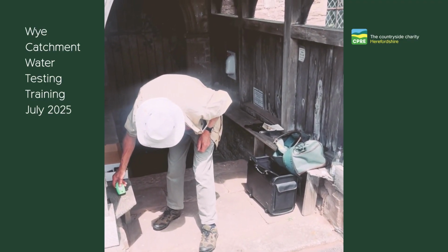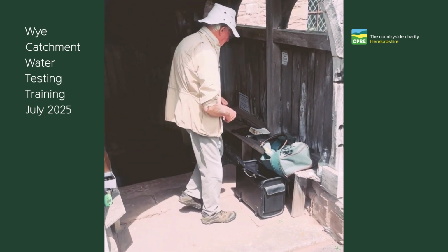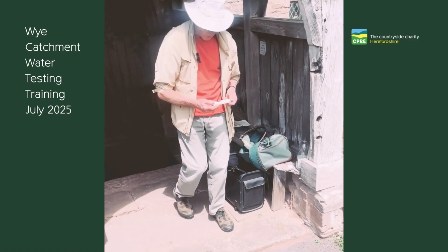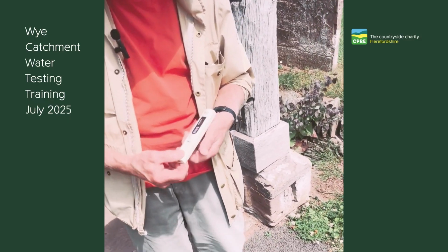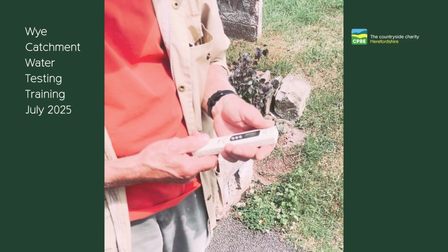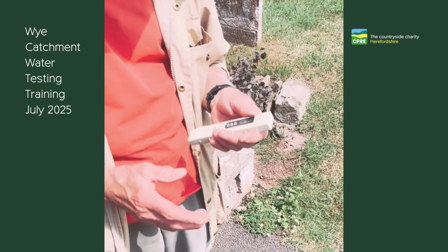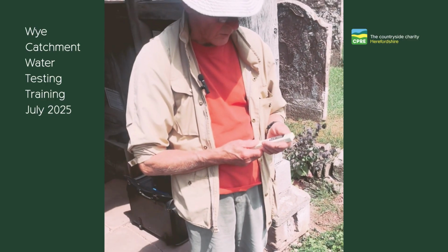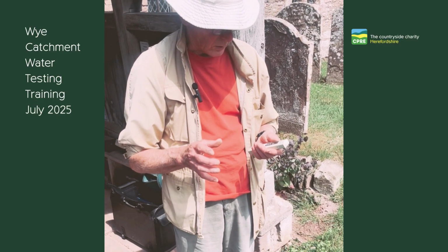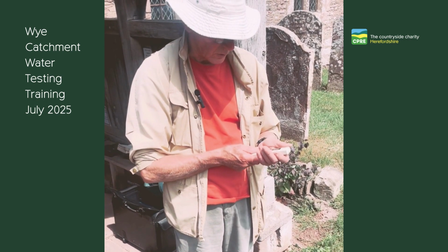Our phosphate test is still counting down, so we'll leave that for a bit, and we'll move on to this device, which is called an EC3 meter, and this performs 2 functions for us. One is to measure electrical conductivity, which is essentially a measure of how much dissolved material there is in the water. The higher the content of dissolved salts, the higher is the electrical conductivity.